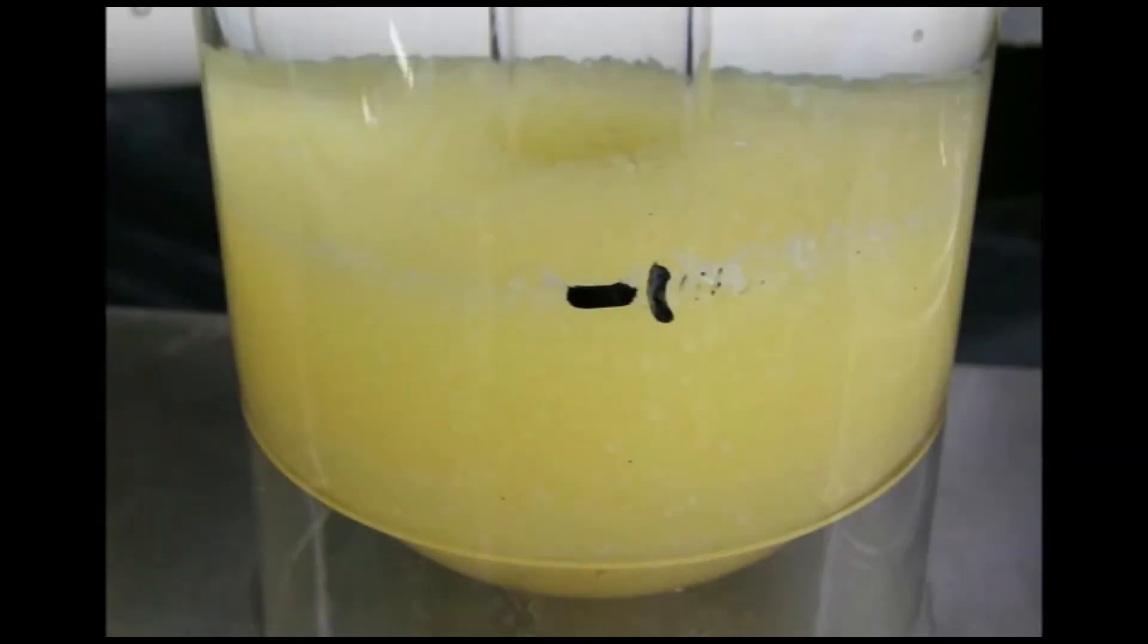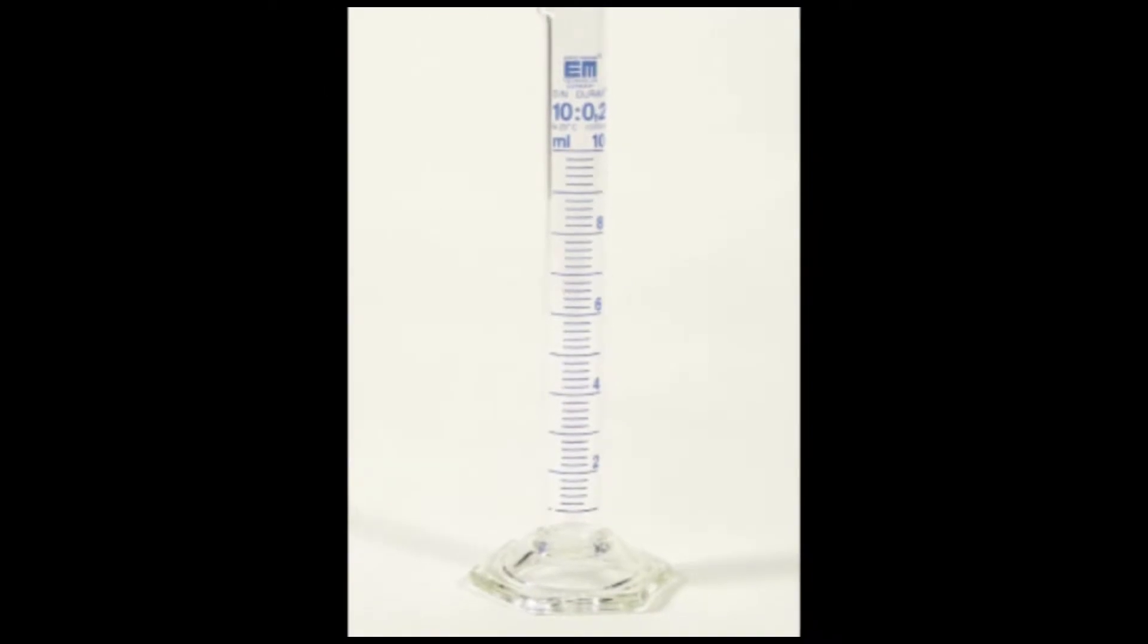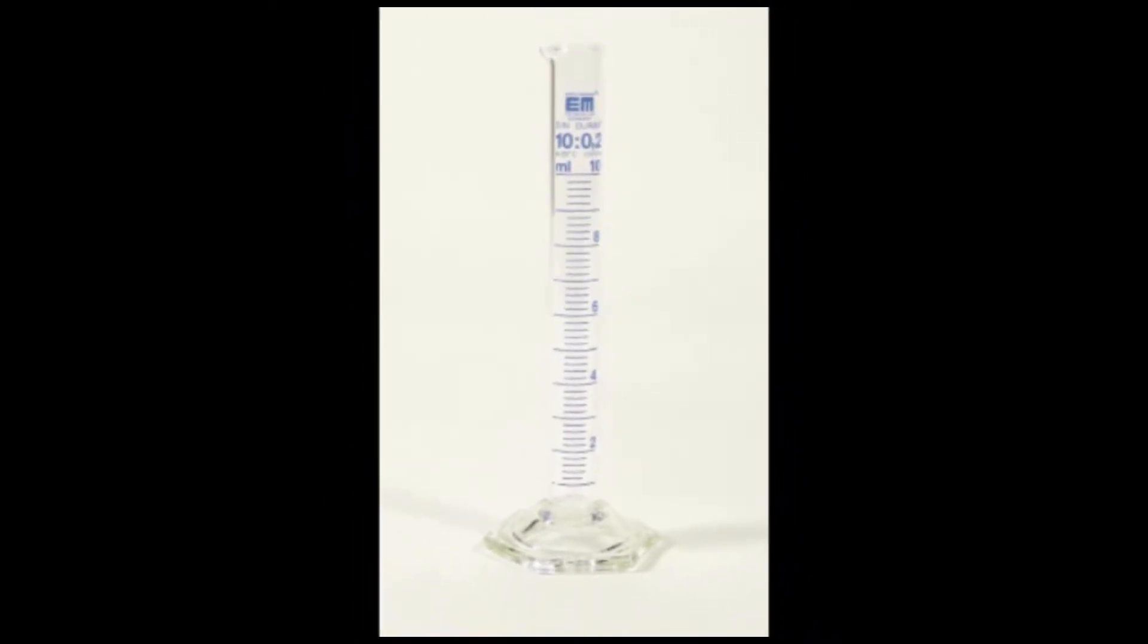Now that the eggs are safely incubating, total egg numbers can be determined. A common methodology used is volumetric displacement, using the total volume of eggs discussed earlier. First, obtain a small graduated cylinder. A 10-milliliter cylinder works well.